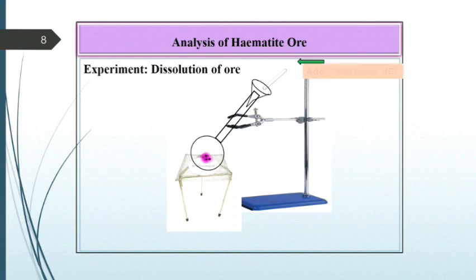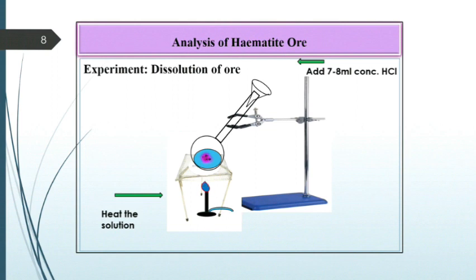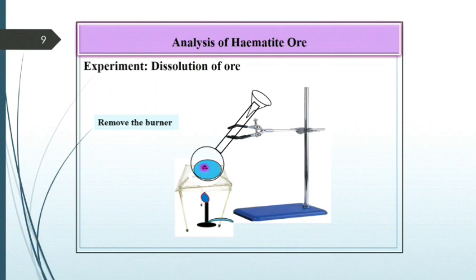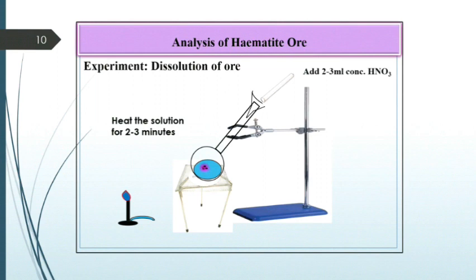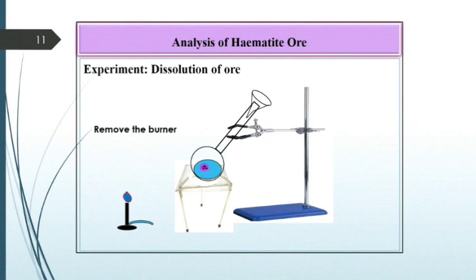Heat the solution by applying burner, thereafter remove the burner and cool the solution well. After cooling the flask, add to this solution 2 to 3 ml concentrated HNO3. After the addition of concentrated HNO3, again heat the solution for 2 to 3 minutes, then again remove the burner and cool the flask well.